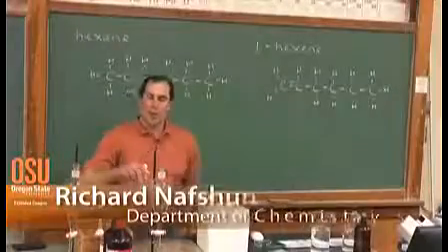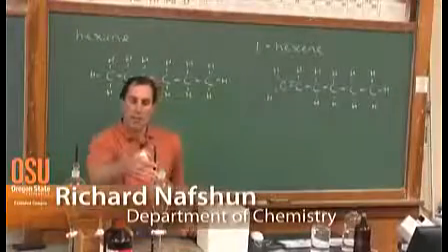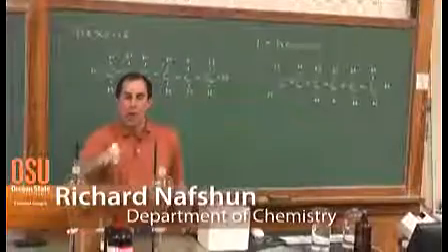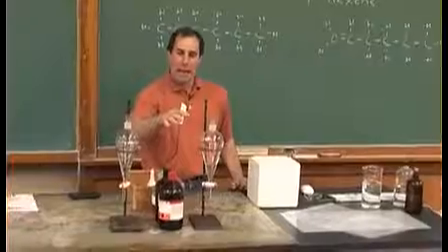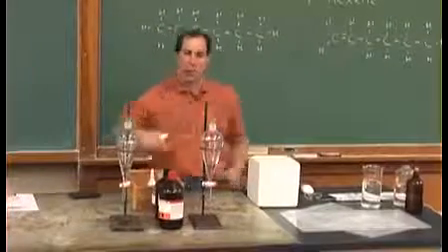Hi, I poured two liquid organics into these separatory funnels, one into this separatory funnel and one into this one. One is hexane and one is 1-hexene. I think I forgot which one. We'll get back to that in a moment.